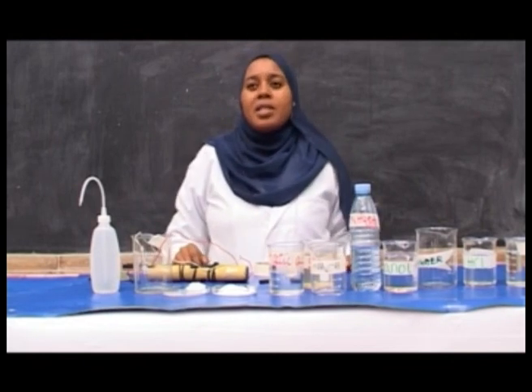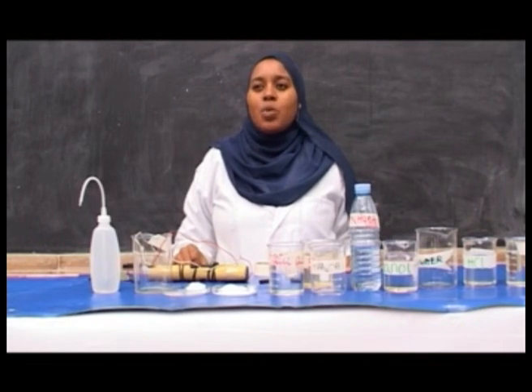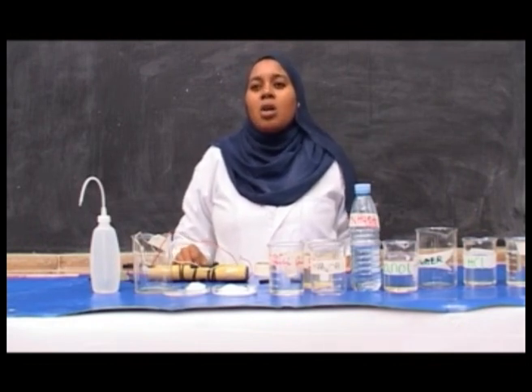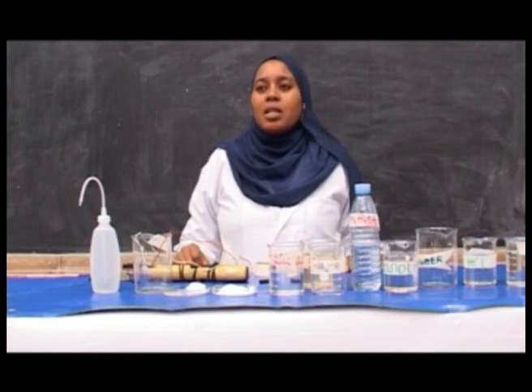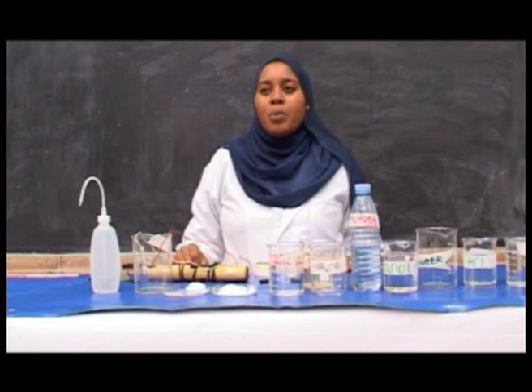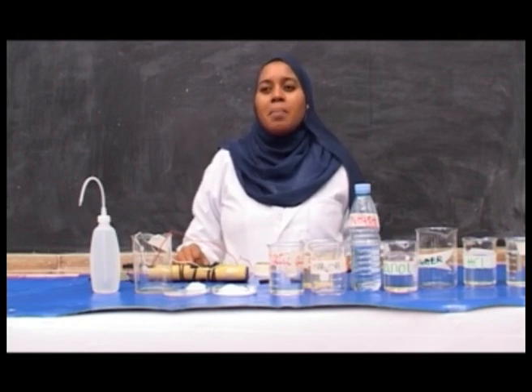Precautions. In doing this experiment, electrodes must be cleaned using distilled water and dried before being reused. Also, if you use a 6-volt DC source, you must also use a 1.5-volt bulb, and if you use a 12-volt DC source, you have to use a 3-volt bulb.